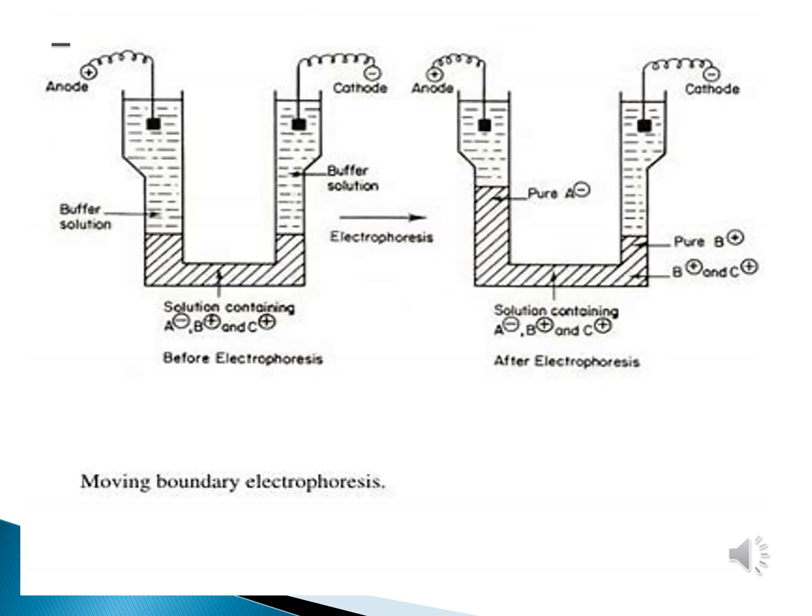This picture depicts the 2D image of Tiselius moving boundary electrophoresis. The setup, a U-tube of quartz crystal, is filled with a buffer solution, and the two terminals of the U-tube contain the anode and the cathode electrode. The middle part of the buffer solution has an opening system in the tube, through which the sample that we are going to separate is injected.